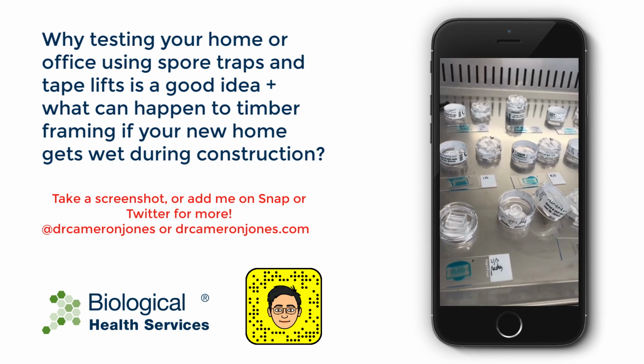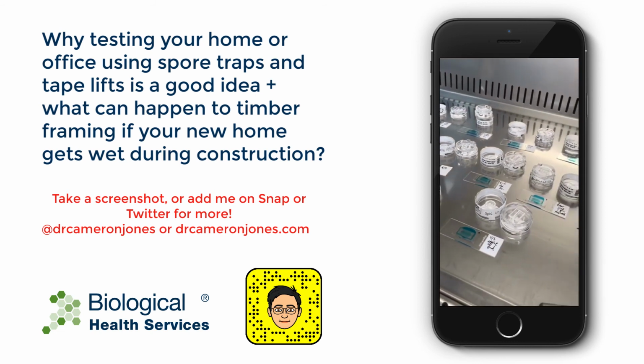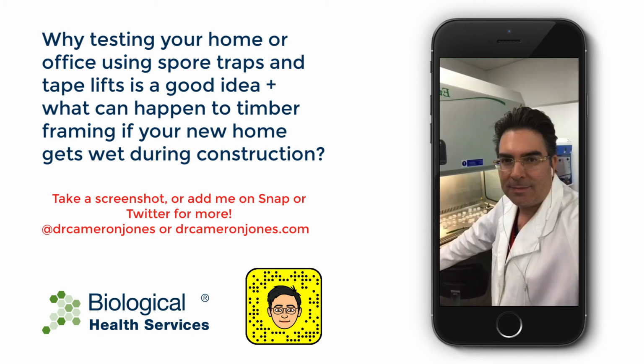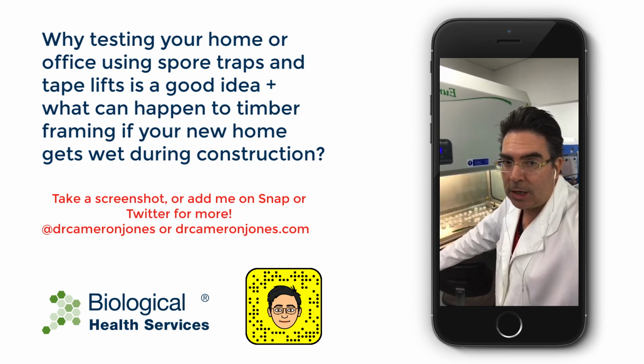Spore traps are a really simple device that allows you to capture samples of outdoor and indoor air onto a sticky microscope slide, then stain it and look at it. I'll now take you over to the microscope and show you exactly what this looks like, but before I do that I'm going to show you where these samples were taken from, okay?